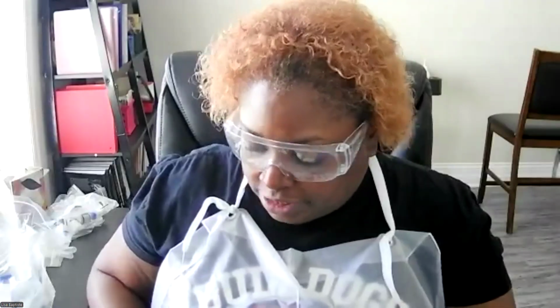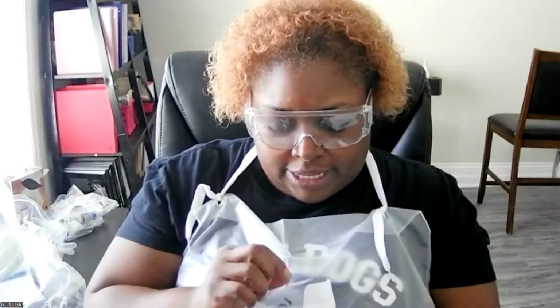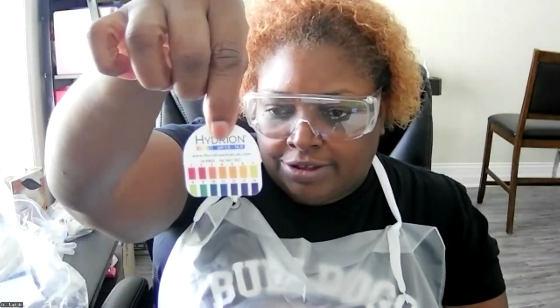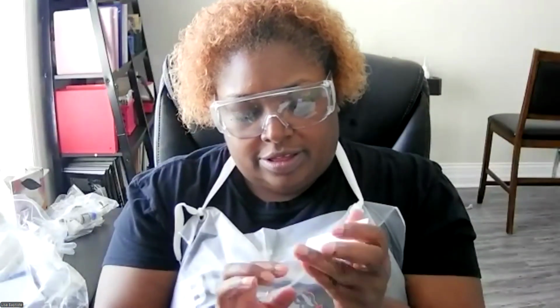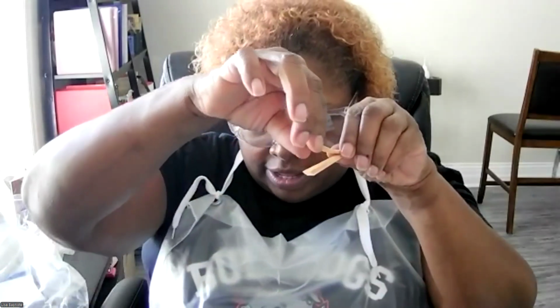And then you have your pH paper. All right, so that's your hydronium paper, pH paper. You'll see when you open it up, it has a little color scale that's going to tell you, based on the color you get, what your pH is. These little orange papers are the pH papers.